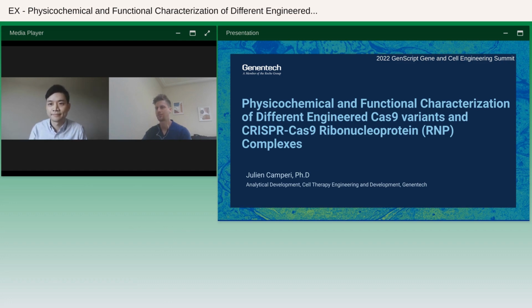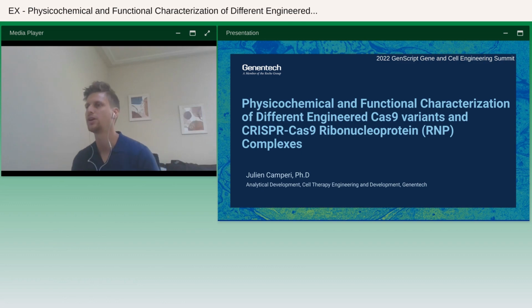Thank you, Daniel, for this introduction. So today I will talk about CRISPR Cas9 and more specifically about physicochemical and functional characterization of different engineered Cas9 variants, and also go further and discuss CRISPR Cas9 RNP complexes.